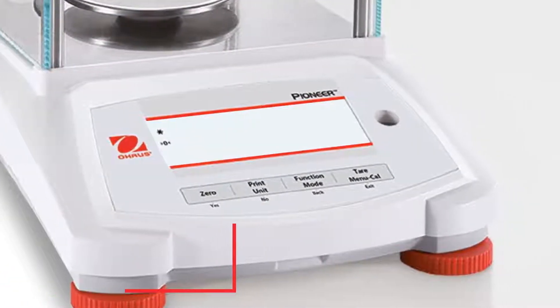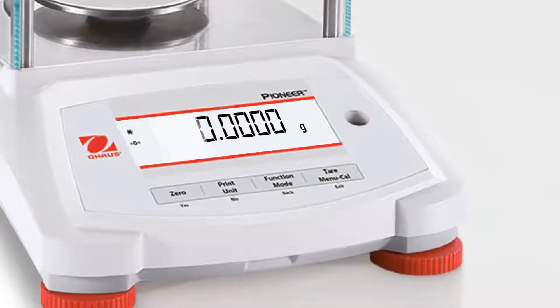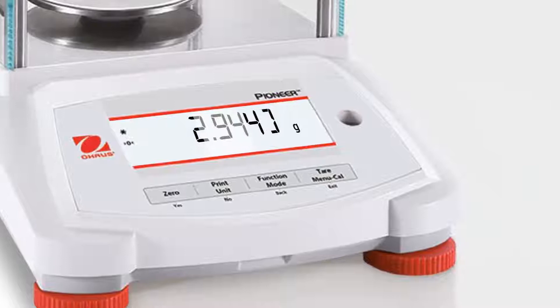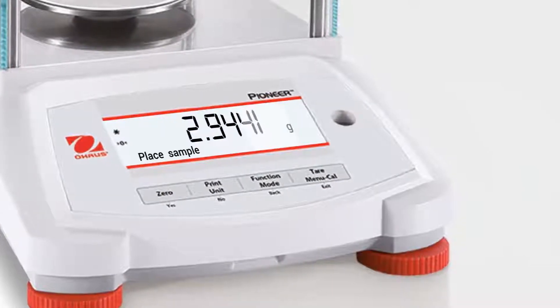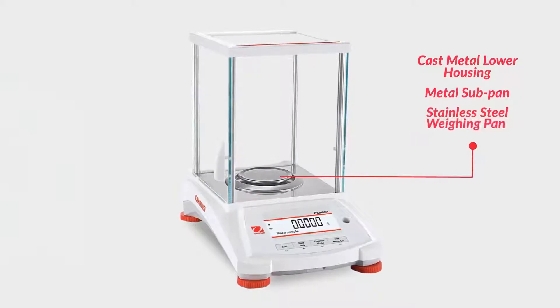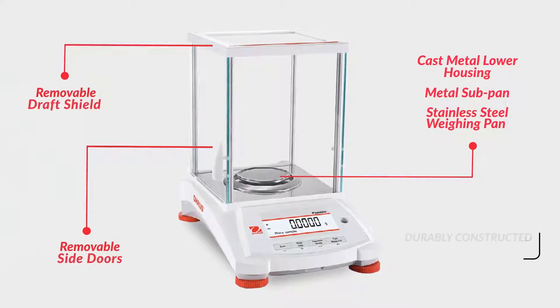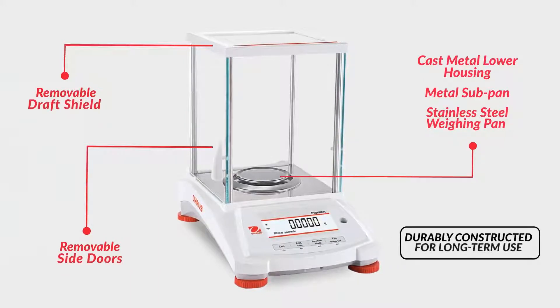A brightly lit dual-line display shows the weight in an easy-to-read manner, while a dot matrix second line provides additional information or guidance prompts to the user. Featuring a cast metal lower housing, metal subpan, stainless steel weighing pan, and removable draft shield or side doors, the Pioneer PX is durably constructed for long-term use and suitable for a variety of applications.